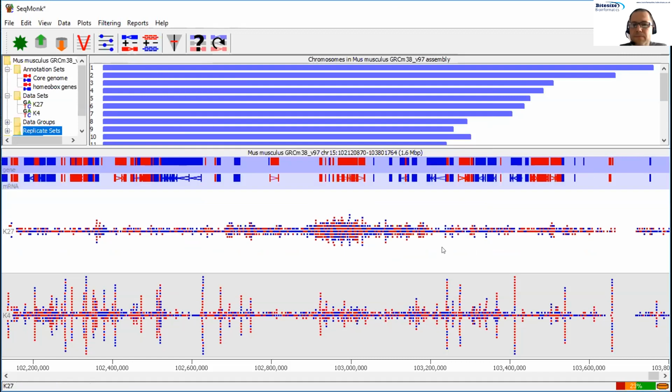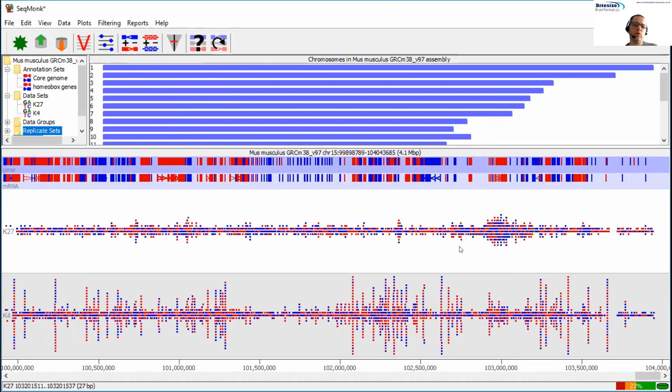Okay, right. So one of the things I said was going to be important in here was saying, well, why do you want to load your data into a viewer like this? Why not just go and stick it into a pipeline, go and get it to analyze it? And the main advantage for having a system like this is that you can see what's going on. If there are problems in your data or things aren't doing what they should, in a visual environment such as this, it's really obvious to see what's happened and to be able to spot problems and fix them or account for them.